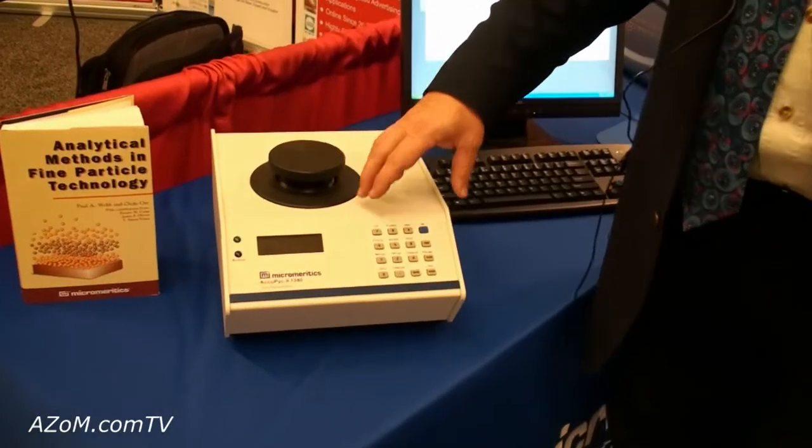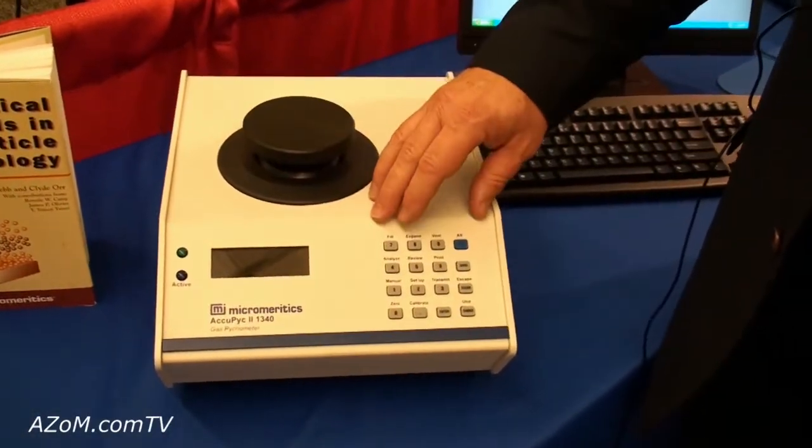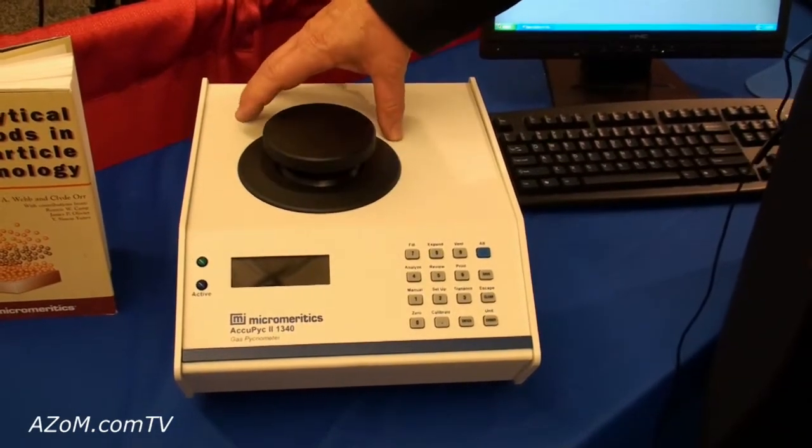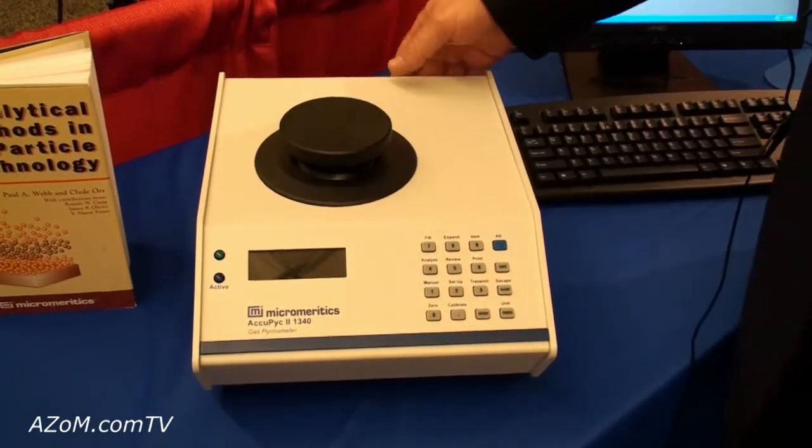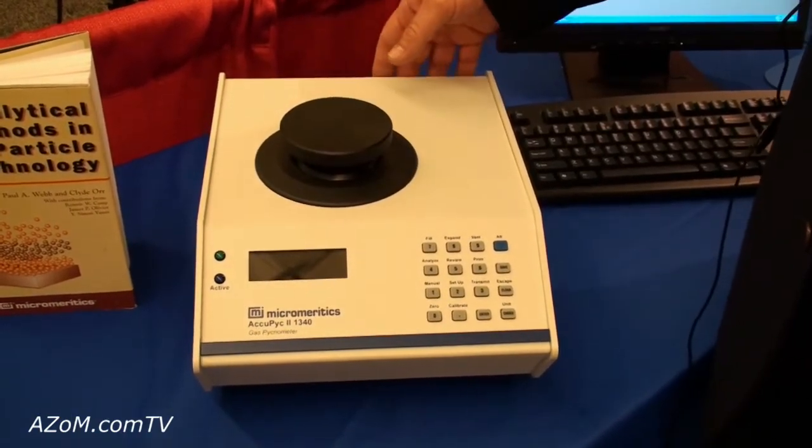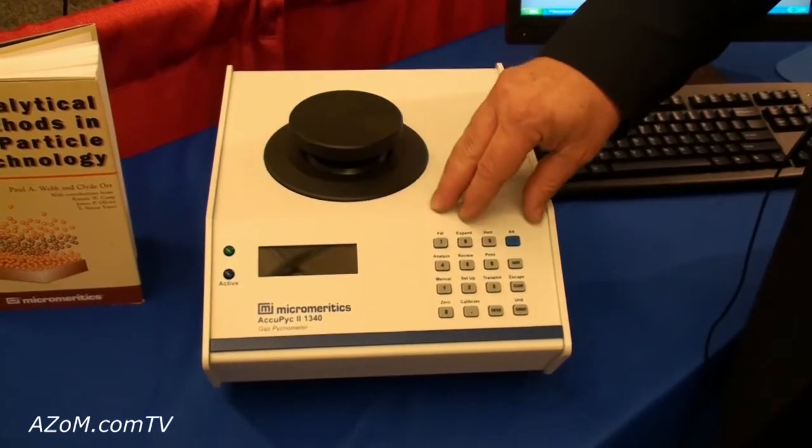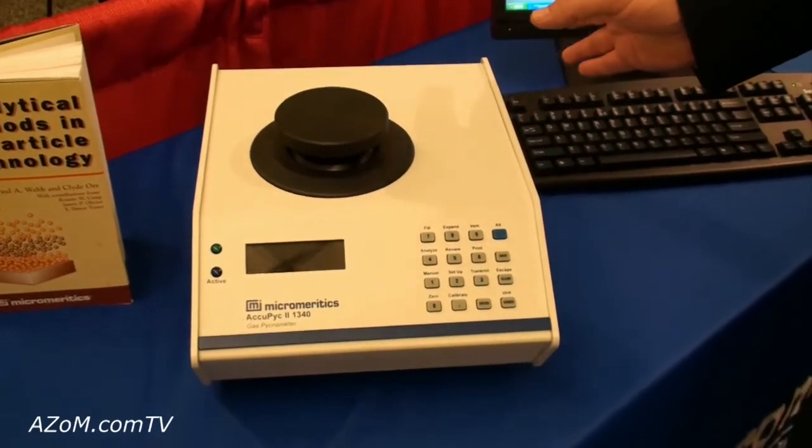Additionally, the ACUPIC instrument, this is the instrument with the built-in microprocessor, as I said. You can actually connect up to five additional analytical units, so it's about this big, to this unit so that you can have the throughput of six independent sample stations. Those can either be controlled from the pycnometer with the microprocessor or from the computer, from the PC.